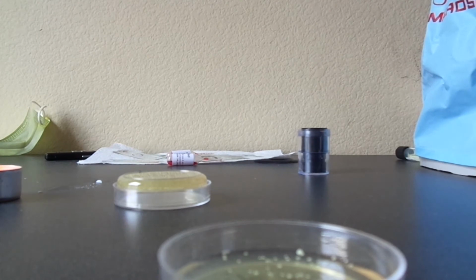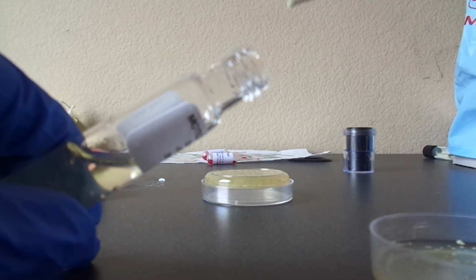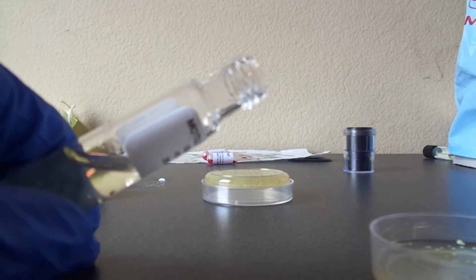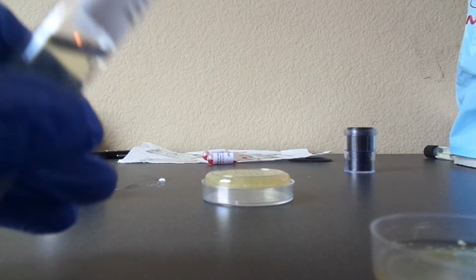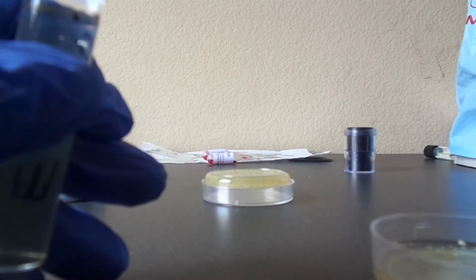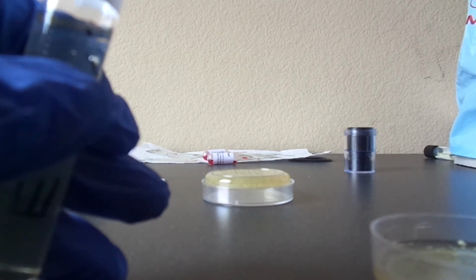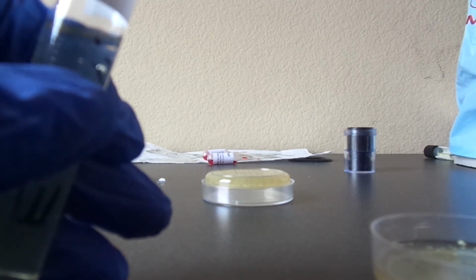And so then I'm going to inoculate it here using a single straight path and pull it out in that same path, so that when it grows, it'll either grow down that path that I'm putting it, or it'll diverge. If it diverges, that indicates the motility of the bacteria. If it grows along the same path, then that indicates that it's not a motile bacteria species.